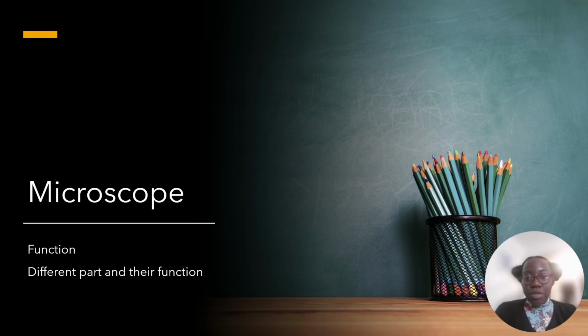Hi, today's video is going to be about the microscope. We're going to see the function of a microscope, the different parts of the microscope, and the different functions of those parts. Let's get started.